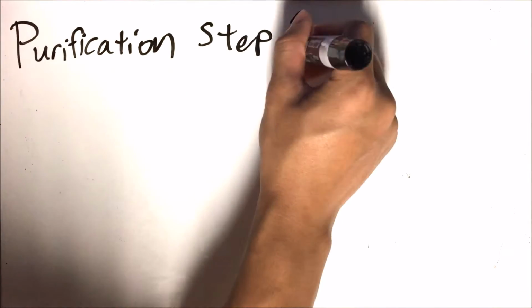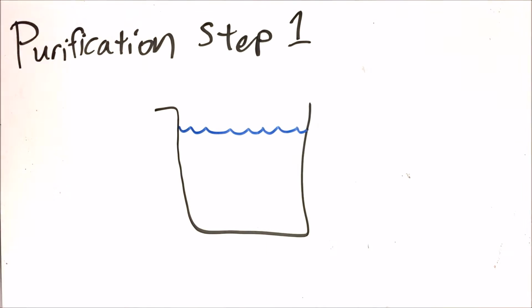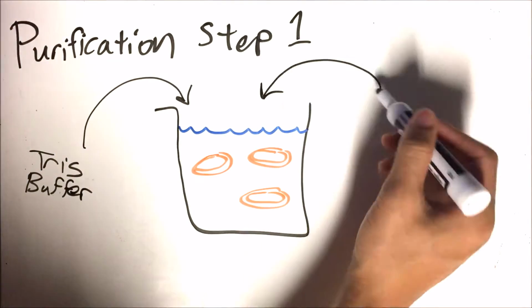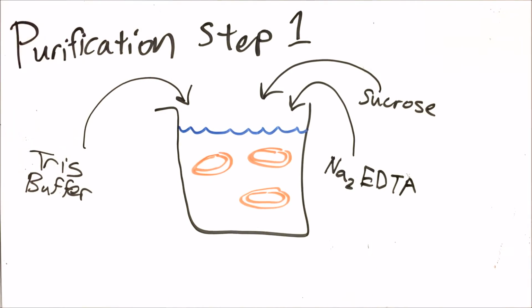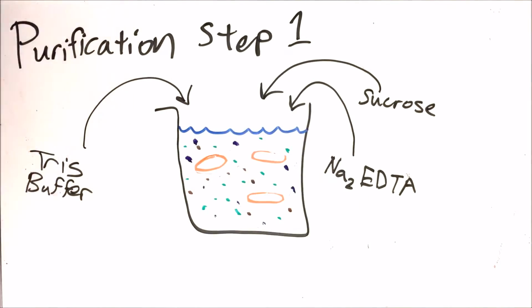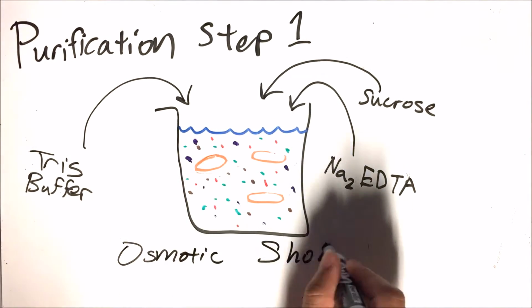Since most proteins are found inside of cells, we want to use a method that would release our protein of interest into a soluble solution while reducing the number of unwanted particulates. In our case, we created an osmotic shock solution to disrupt only the outer membrane of E. coli to release the contents of the periplasm, which contains AP and other proteins.